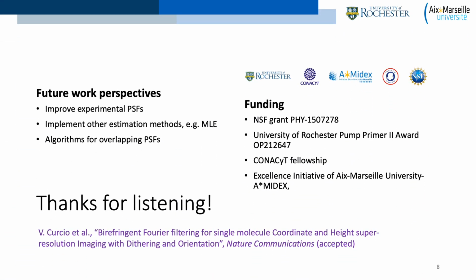Some future work perspectives. We would like to improve our experimental PSFs. Also, so far, we have used only the minimization of the RMS error in order to fit our PSFs. We would like to implement other estimation methods, such as the maximum likelihood estimator, and why not also use algorithms for overlapping PSFs.